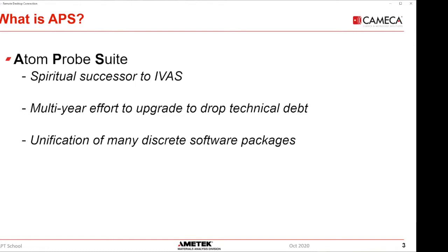So IVAS 3 has been a little bit of a stasis holding pattern for a few years now, as we've been totally shifted over to working on Atom Probe Suite. And Atom Probe Suite also is an effort to unify all these different software packages that we had before.